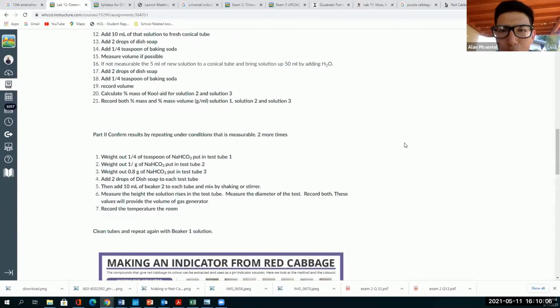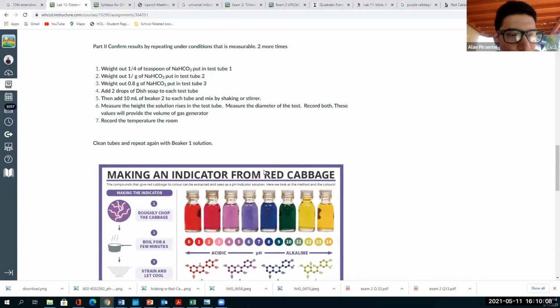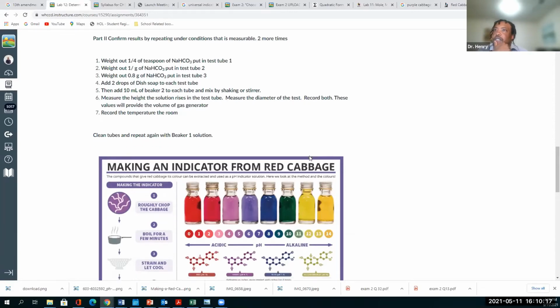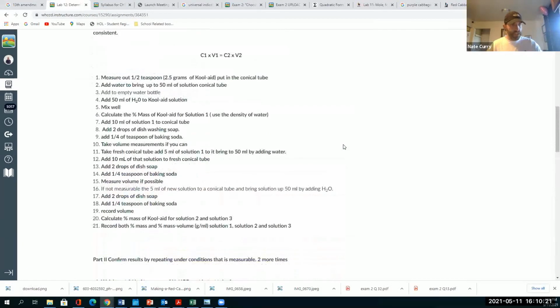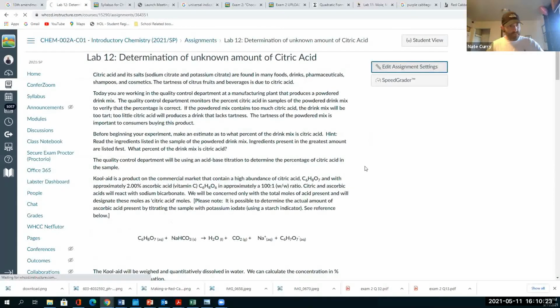In the report, do we tell you how the colors changed? All right, tell me the color and the pH that you got. Okay then. All right, I'm doing cabbage in vinegar.